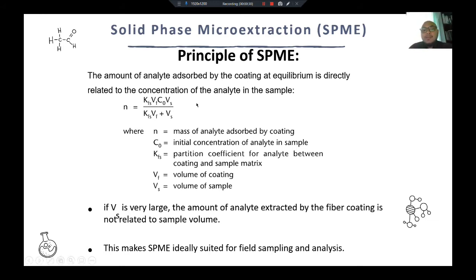Okay, so kalau dekat sini dia ada kata juga, kalau kata volume of sample is very large, kita boleh neglect sebenarnya volume of sample tu dalam kita punya calculation. Sebenarnya kita boleh neglect, sebab kita guna micro amount of sample sebenarnya, just tiny amount of sample sahaja. Orang kata tak membazir pun sample tu kan. Okay, but you may need only less than 1 mil. Maybe you just need 0.5 mil of sample, because it's very micro amount lah. Okay, tak perlu banyak sebenarnya untuk SPME ni.